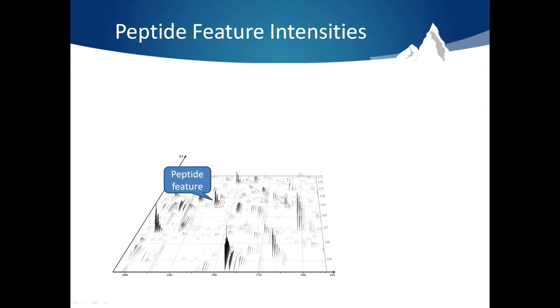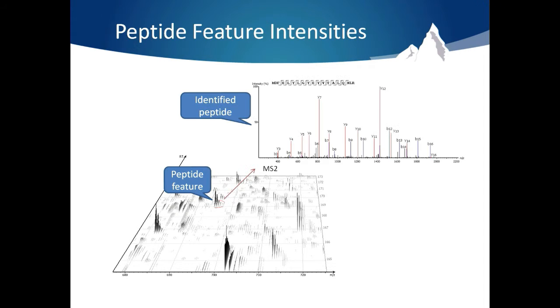We then have to group these peptide features. If that feature is selected as a precursor ion for MS-MS and then that MS-MS is identified we can link the two together. This is how we are able to match peptide feature intensity with an identified peptide.